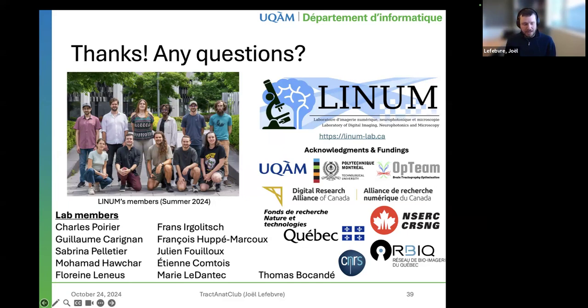I think I saw in one paper, they were trying to compute how much data we will need for the whole human brain, and I think it was in the amount of petabytes for a single brain. So now we need to work on dedicated tools and neuroinformatic tools for this kind of multidimensional big data. That's, in my opinion, the main challenge. And there are already some efforts to work with this.